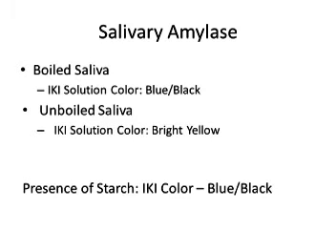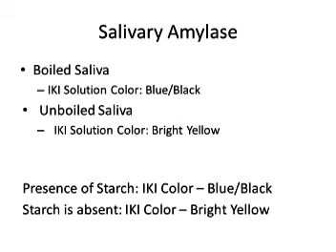Next, we're going to go over the specific solution that we used to measure salivary amylase, which was IKI solution, or iodine potassium iodide. When starch was present, the color would be a blue or a black color.